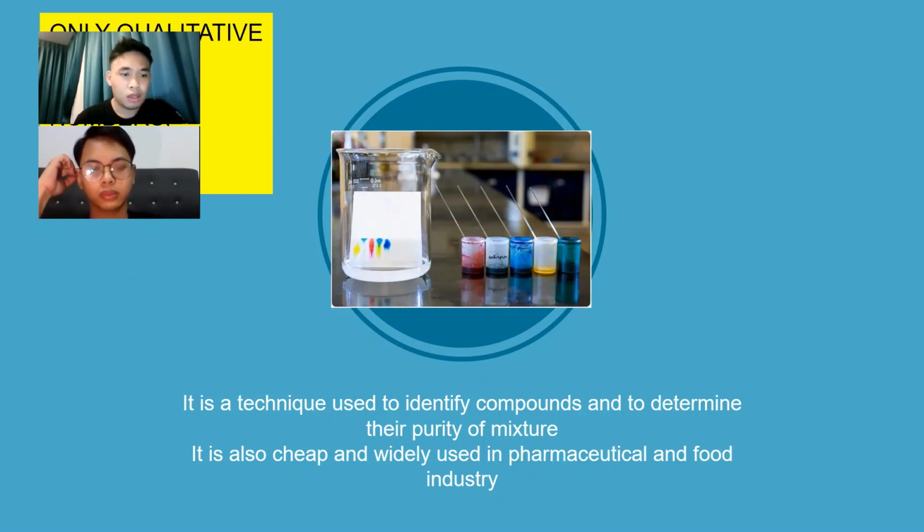It only involves qualitative analysis. There are two types, qualitative and quantitative, but in TLC, we only use qualitative. The result will come out with numbers, data, and measurement.